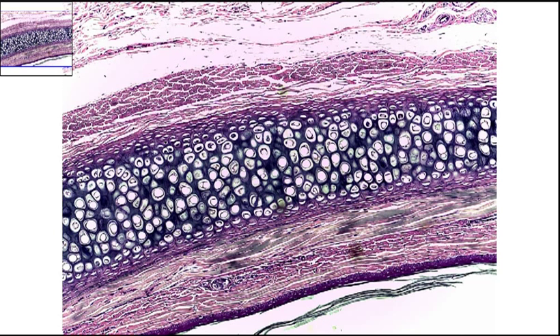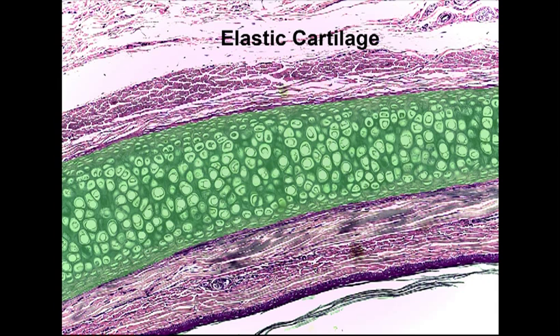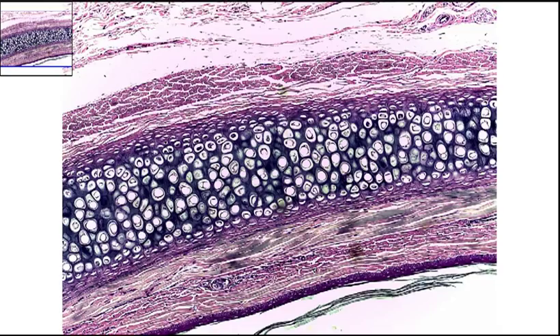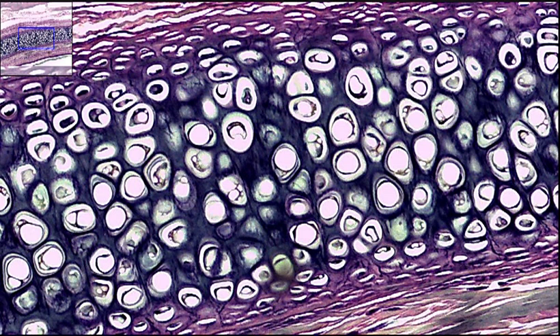This slide is your elastic cartilage. The current magnification is 100x total magnification. What we're looking for are the cells and the features that help distinguish this as elastic cartilage. It's this area right here that is your elastic cartilage. As we zoom in, you can see a little better detail of the actual elastic cartilage. The entire window here is now filled with elastic cartilage.